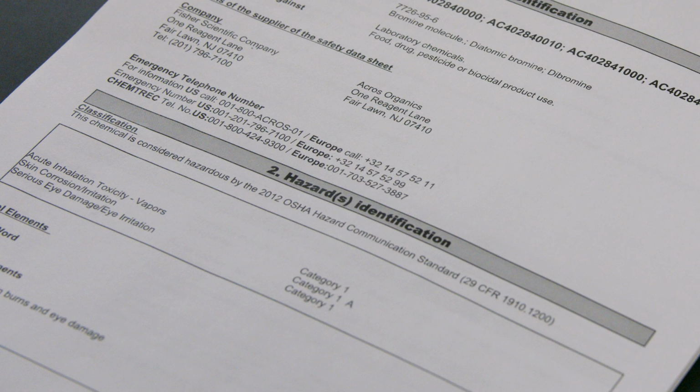Section 2 is all about hazard identification. It tells you about the chemical's classification, its hazards, and any signal words like danger or warning. Pay close attention to this section to understand what's at risk in the lab.